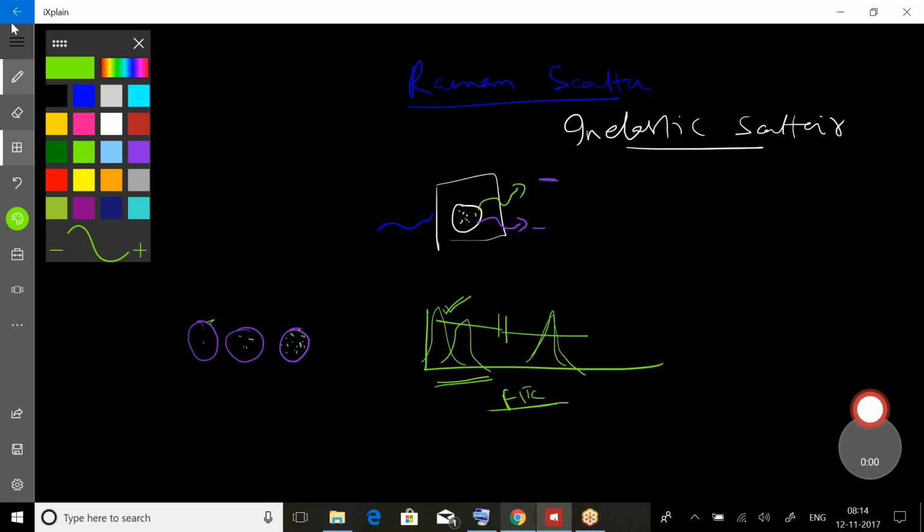Where the signal comes from here is because of the other molecules the cell contains. The cell is not binding to the FITC molecule. However, there are other molecules present on the cell that have a similar excitation and emission spectrum. Those molecules get excited by the light, and they are also emitting too, but their level of emission is low, or their level of getting excited by the blue light is low. So in either case, they give very low fluorescence. However, we will still see some signal.